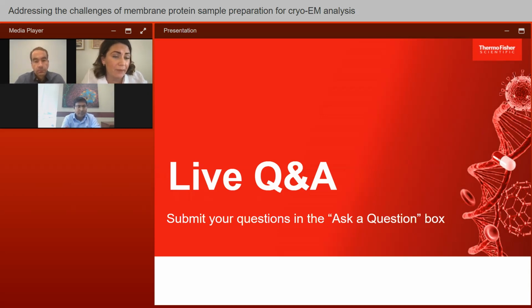And sometimes those Fabs will bind to different epitopes. For example, I've had one that bound in the cavity where I was predicting that my substrate was going to bind, right? So that's not really ideal if you want to get a substrate complex structure. And so in that case, you then go and do the epitope binning, and you can determine which one's binding to a different epitope and then move forward with that one.